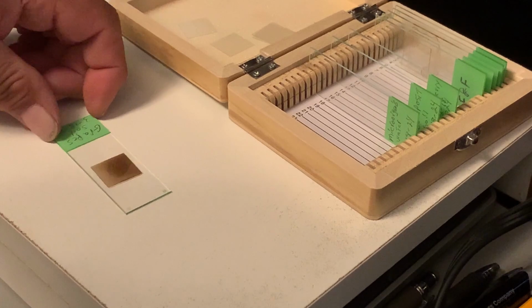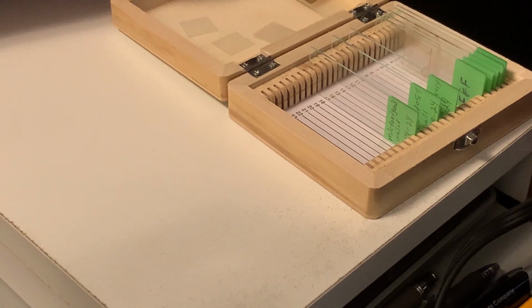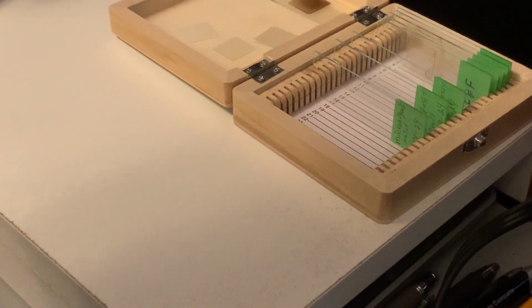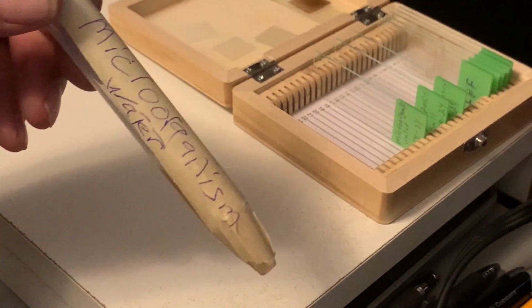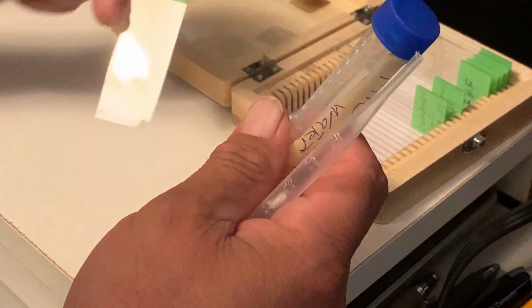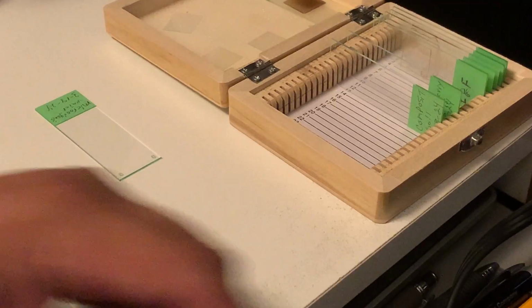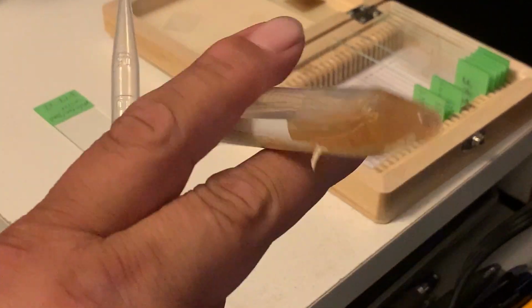All right, so let's set this to the side here. We don't want it to bleed out. Next one. It says microorganism water. Here we go. Microorganism water. And then we take the pipette. Take a slide. And we got a cover glass. Now we have to go back to the microorganism. Alright, so this one. Nice gentle roll.